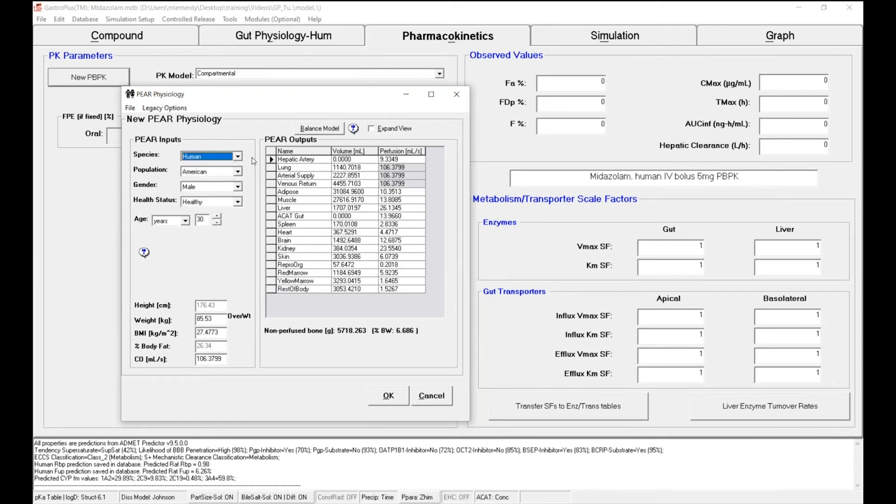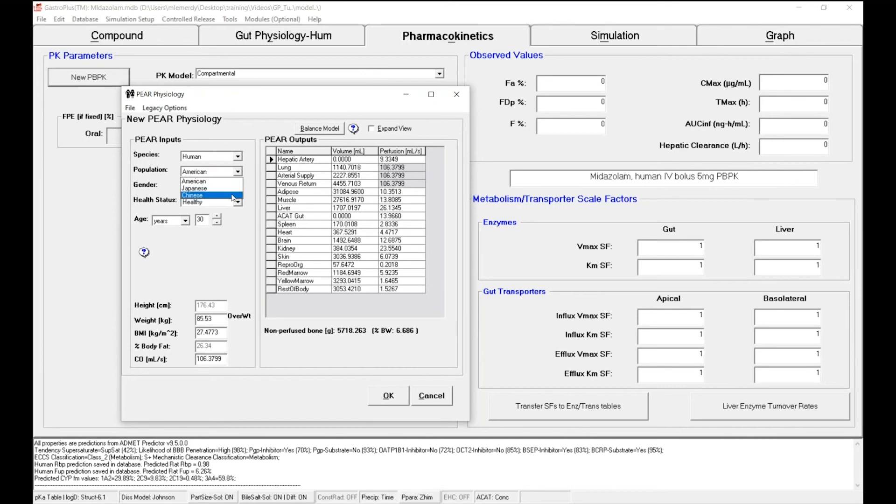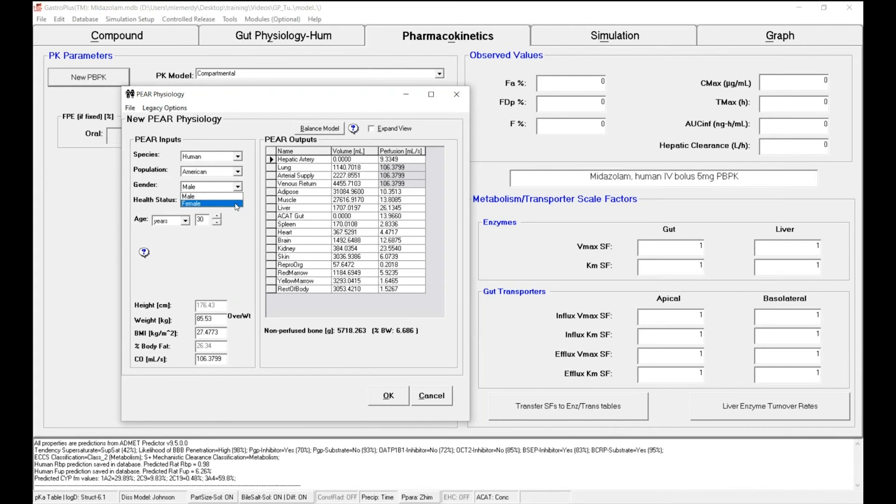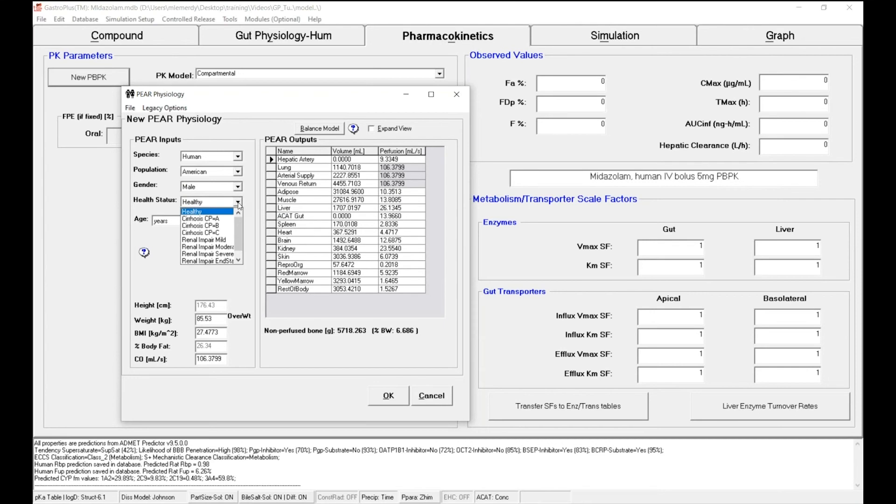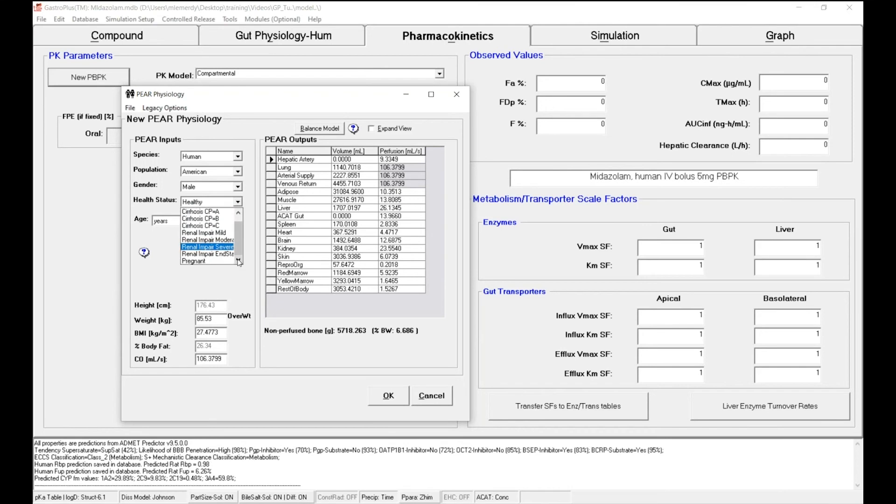If you want to describe a human individual, you can define its population of origin: American, Japanese, Chinese. You can define its gender, male or female. And you can define its health status, whether your individual is healthy or if he is presenting signs of cirrhosis, renal impairment, or if you have a pregnant female.